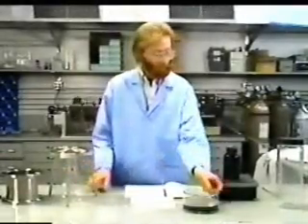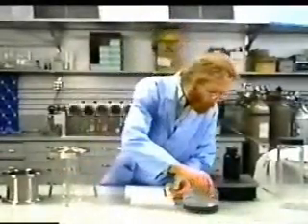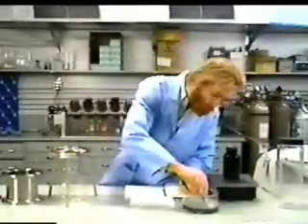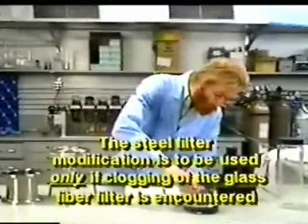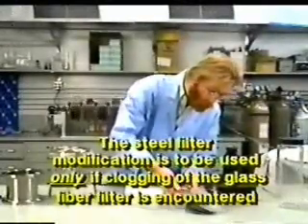Jeff Keever of RTI will now demonstrate the modified method 1311. This demonstration concentrates on the steps of the procedure that are different when the steel filter is used. The steel filter is to be used only for wastes that cannot be filtered through the glass fiber filter.